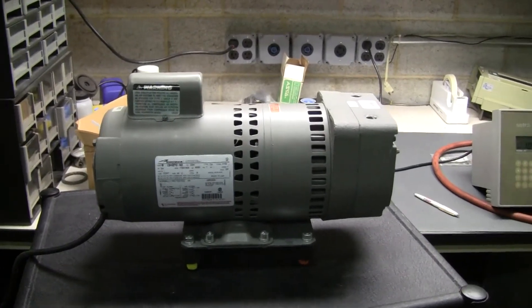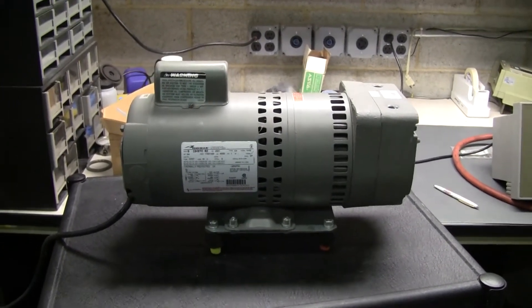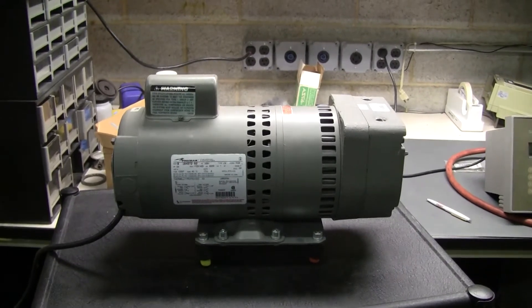Hi, this is Cody Young from Hi-Tech Trader. Today we're looking at a Thomas Rotary Vane Oil-Free Vacuum Pump.